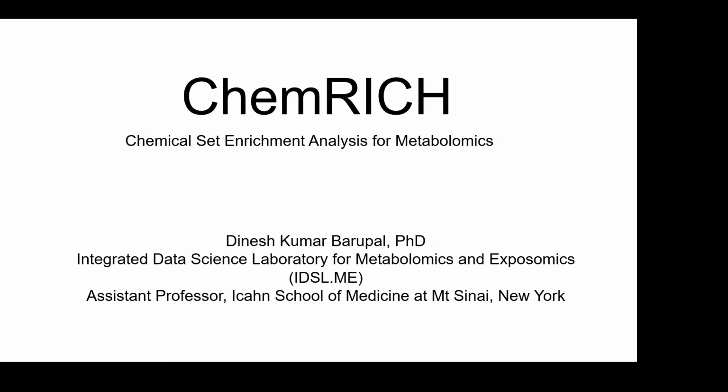I'm now leading my own lab at the Icahn School of Medicine at Mount Sinai, New York. The lab is working on developing integrated data science solutions for metabolomics and exposomics. There were ideas around improving ChemRICH to include compounds that were missed in the first version, so I updated the software and wanted to give an introduction to those updates in this webinar.